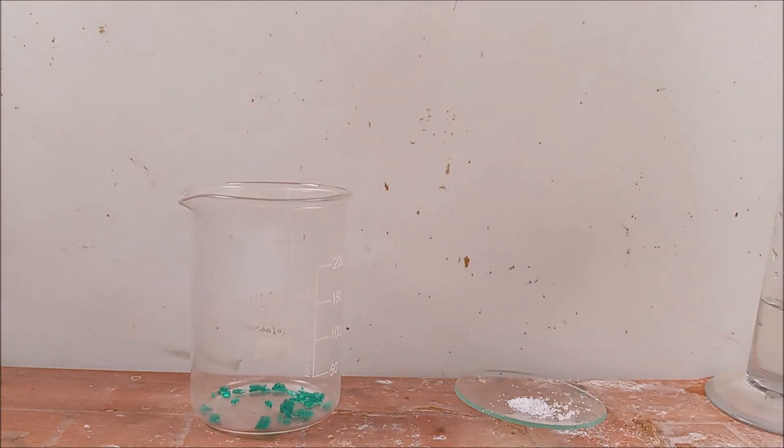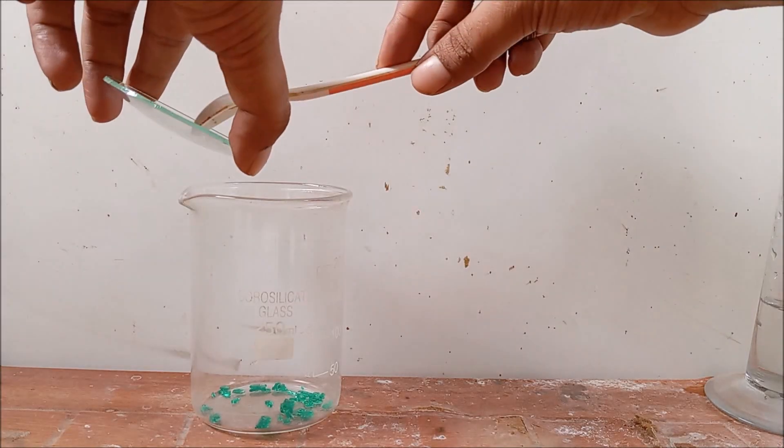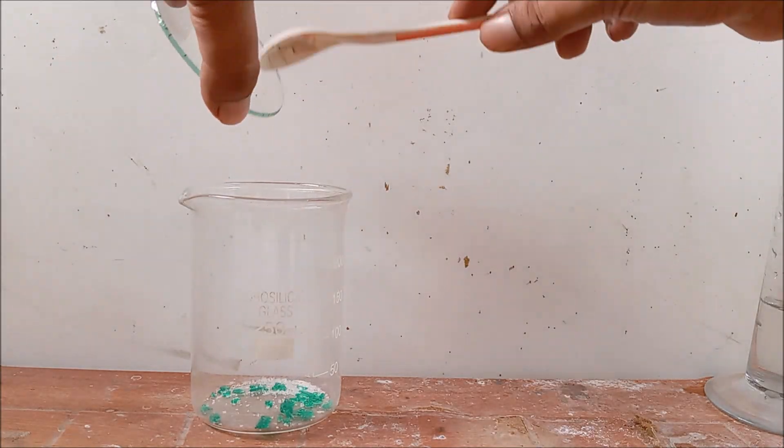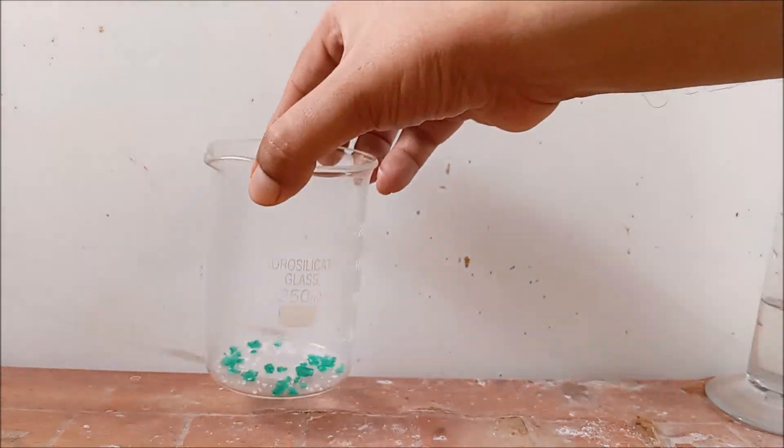Here I have taken 1.3 gram of nickel sulfate heptahydrate in a beaker. Add 0.6 gram of ammonium sulfate to this. Dissolve this in about 25 milliliters of water.